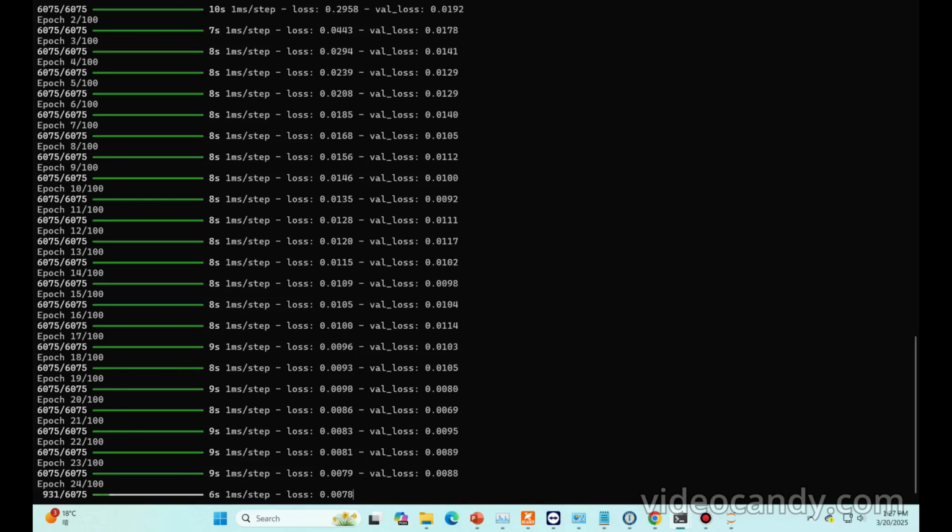Now you can see, last time, if you remember, you can see my tutorial. If you go back, you will see it ended on 19 epochs, but here you can see more epochs. Why? Because I changed the value from 0.1 to 0.3 for the separation power. It will show you more dense clusters for the data sets.